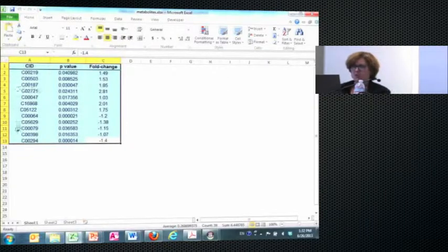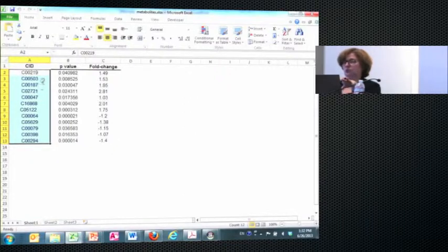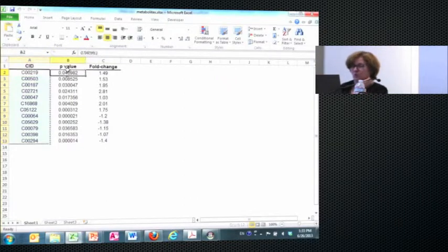So the metabolite data set is quite small. There are only 12 compounds. All 12 looked relatively significant. I only took the most significant compounds. And so this is the basic data format. Notice that in this case, rather than using names, I'm using what are called KEGG IDs, because I don't want to go through this drop down and disambiguate every synonym and so on and so forth. So I just took KEGG IDs.